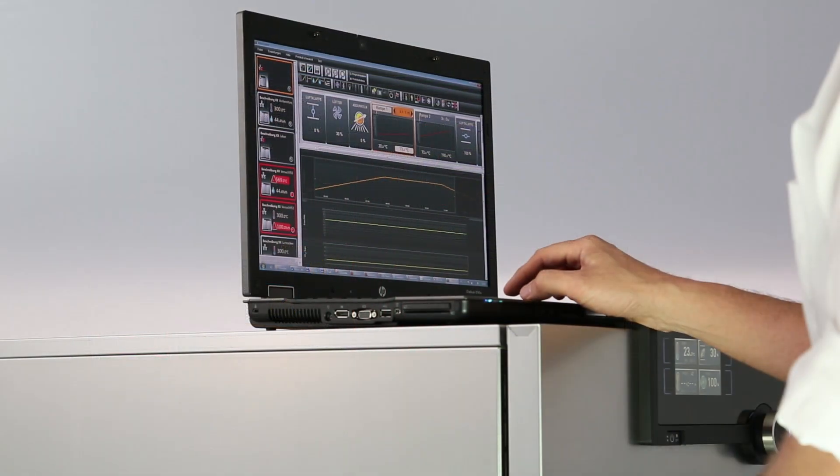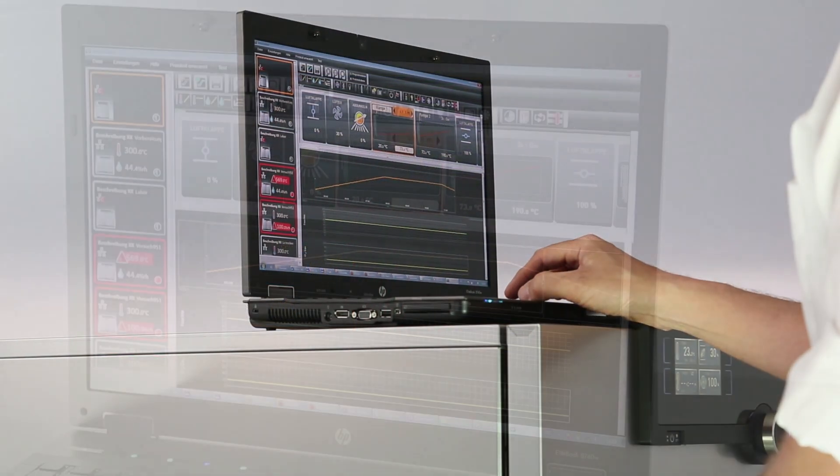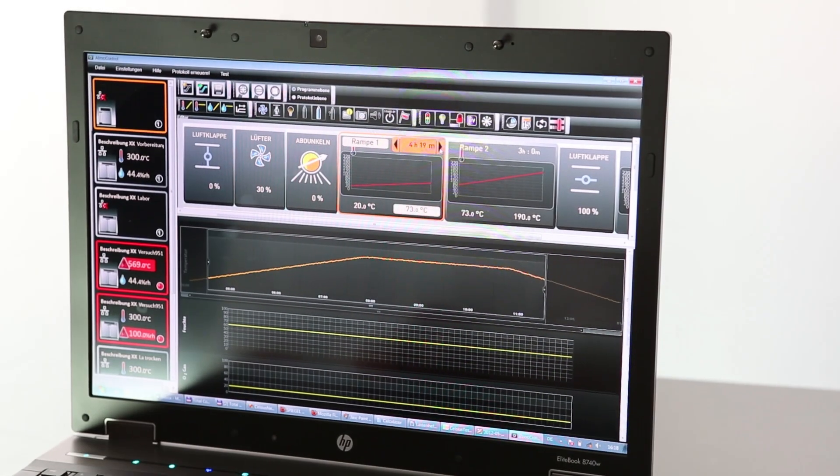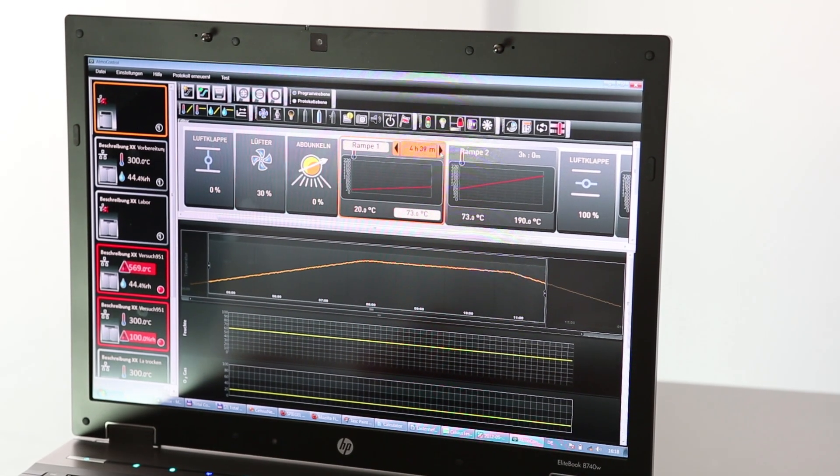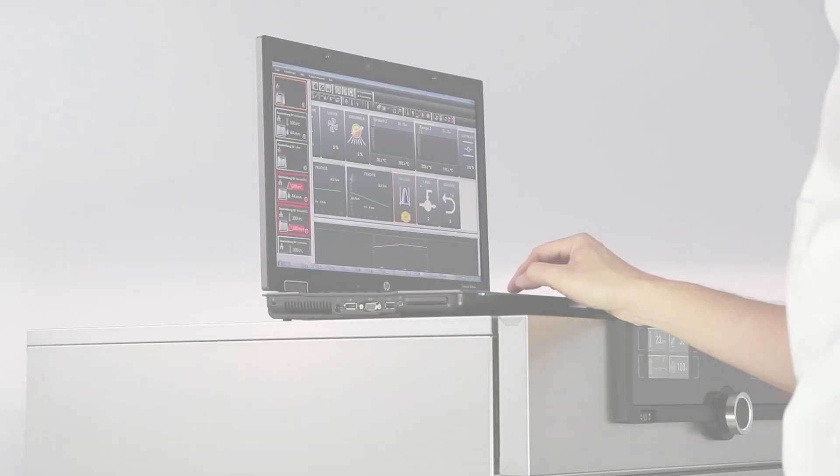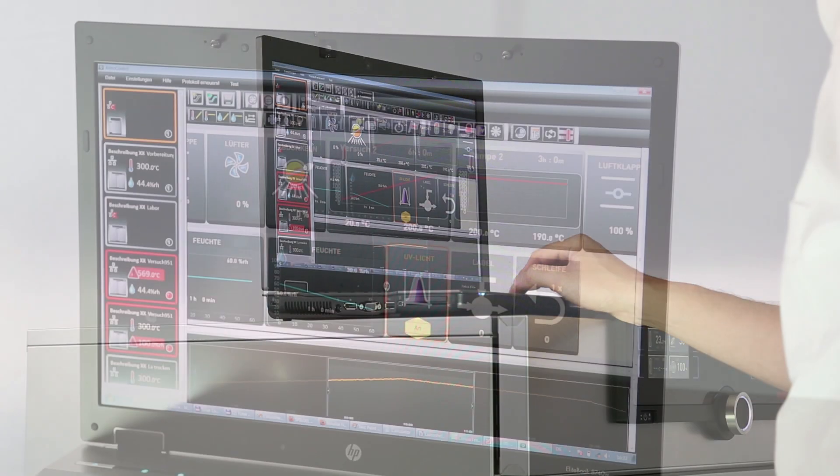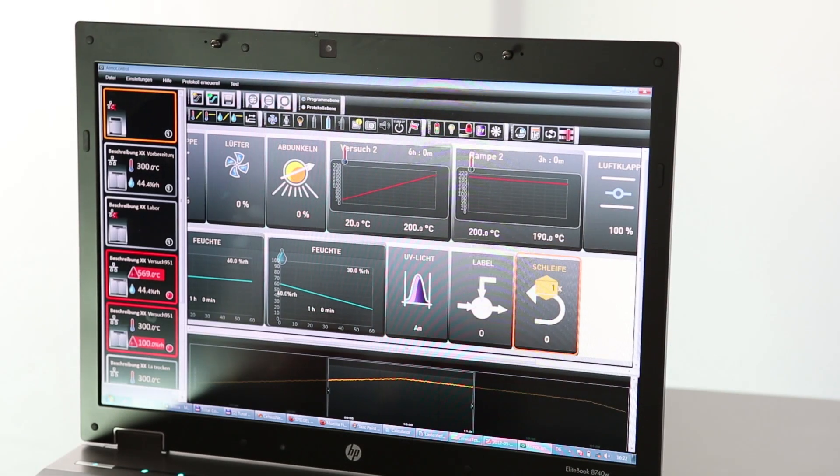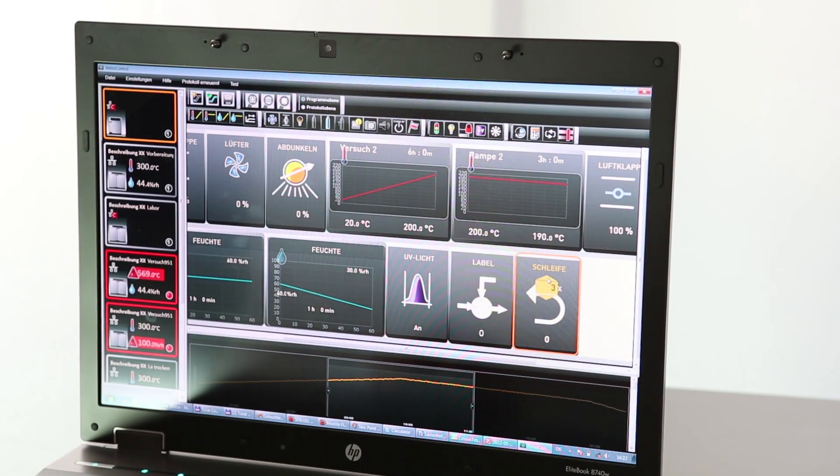With just one click you can change the parameter settings, quick and easy. Repeat functions can be inserted in any place within the program sequence.